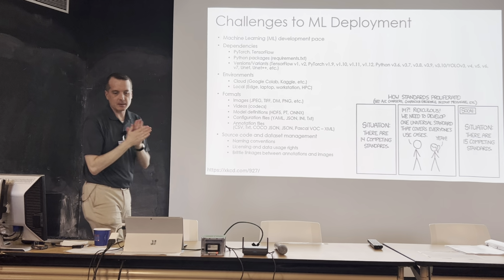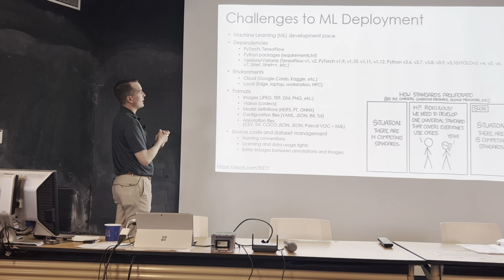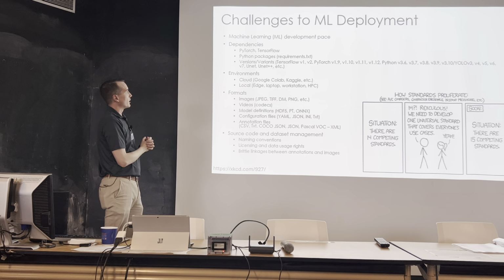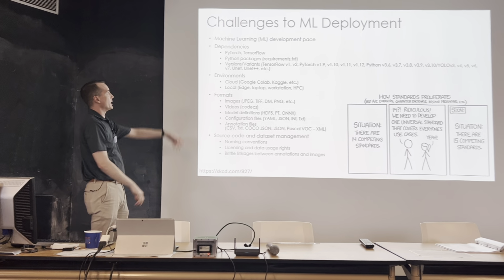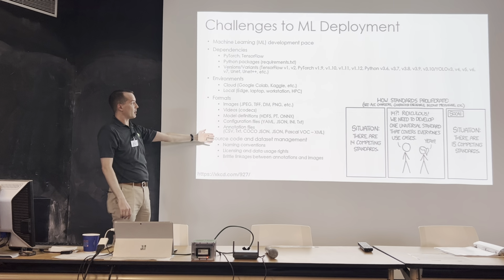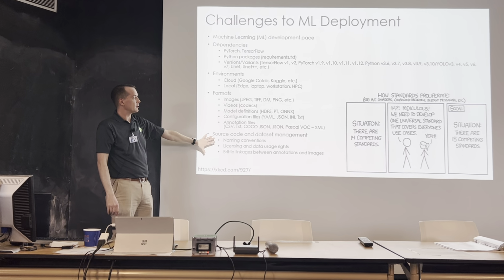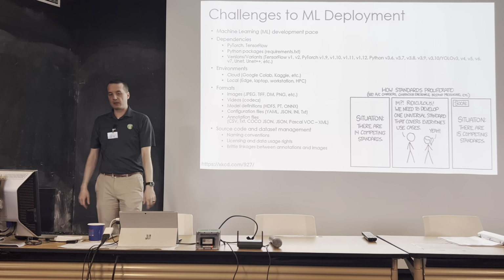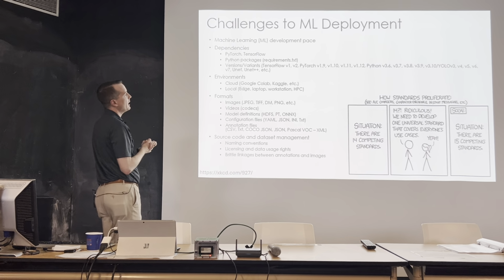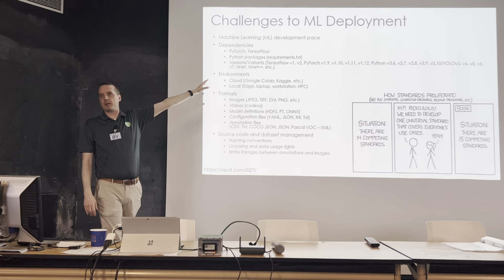But there are, of course, some challenges to machine learning deployments. I talked to some of you earlier today about some of these and commiserating on them. Of course you have a variety of standards, and we're maybe going to add some more. You start off with your dependencies, the environment that we're in, and then there's the variety of formats you have to handle for the machine learning, but also for the microscopes. Then you have source code and data set management, and not everyone is a software developer and knows what Git is and how to use it appropriately. So you have all of this that you need to do. None of this any microscopist ever wants to deal with.